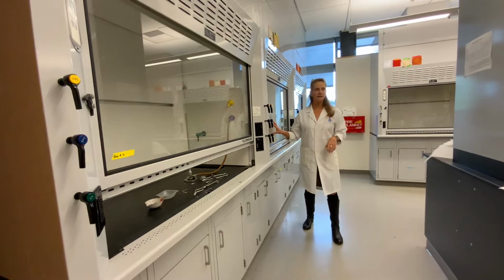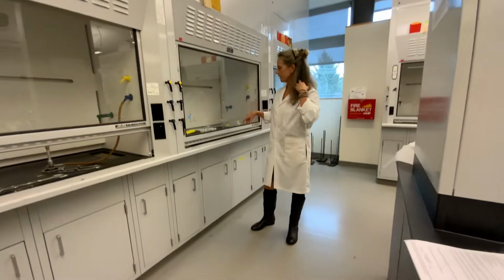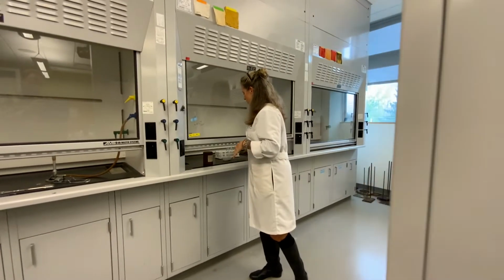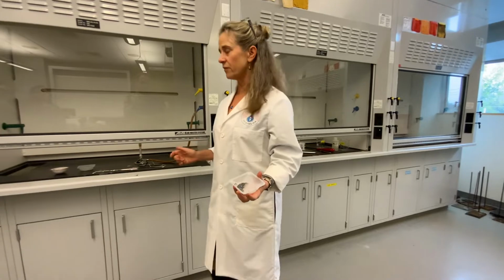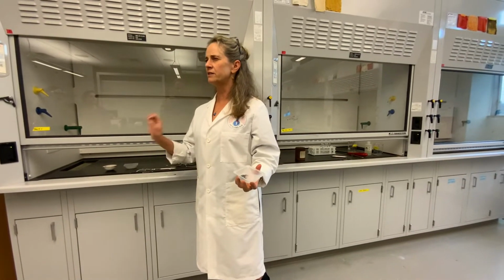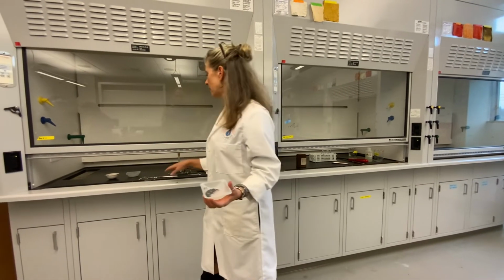Experiment number 5 and 6. Okay, this is a twofer. You're going to get 2 reactions out of 1. And I, again, encourage you guys, this is magnesium also, and if your lab says zinc on it, maybe on the table, make sure you correct it, okay? It may have zinc on there. I fixed it, but I think if you have an older copy, it's not fixed.